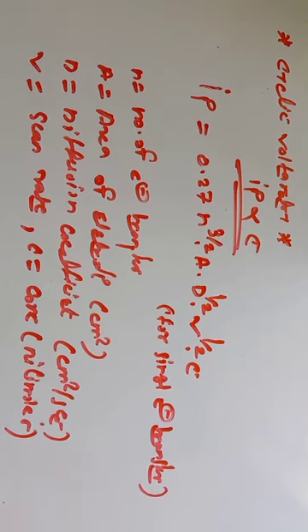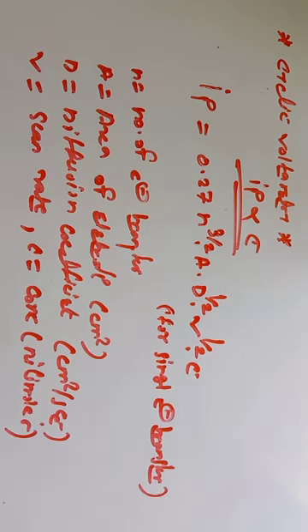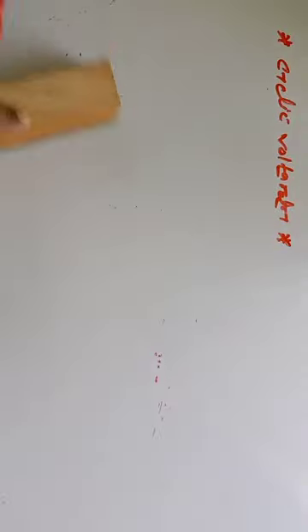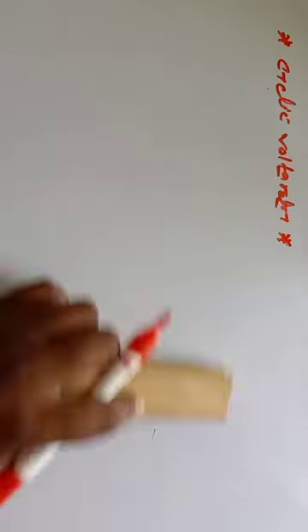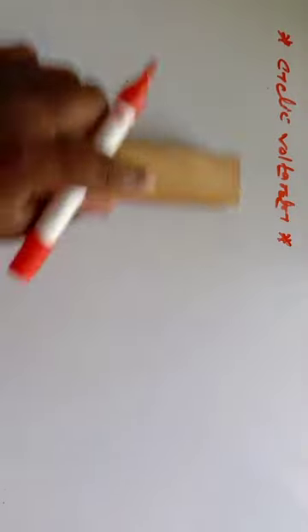For a reversible reaction, we scan the potential from more positive to negative and then from more negative to positive. For a reversible reaction, the peak observed during the reverse scan is the same as the peak observed during the forward scan. We already know what the forward scan and reverse scan are.